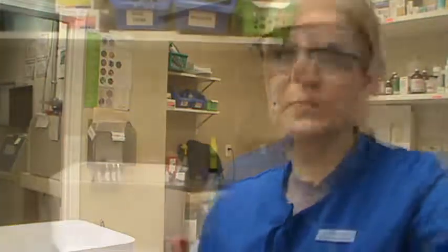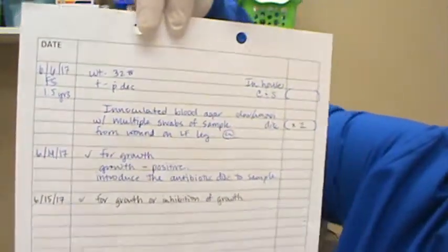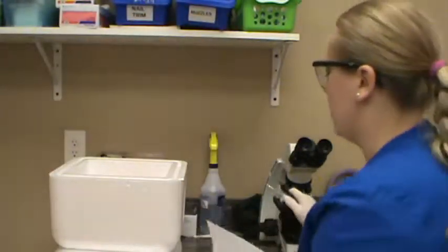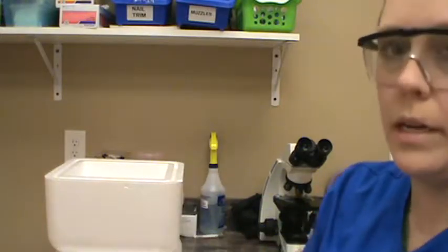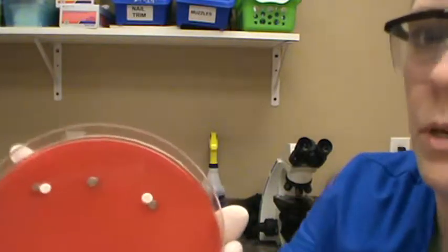This is Chelsea Marks, and we're back filming for VETT 222, task 18, which is a culture and sensitivity. We have our patient chart here, and yesterday we introduced the antibiotic discs to the growth on the sample. So today we're going to check for growth or inhibition of that growth 24 hours later. We have our plate that's been sitting in our little makeshift incubator here. And yesterday we showed you that there was growth. Let's open this here.